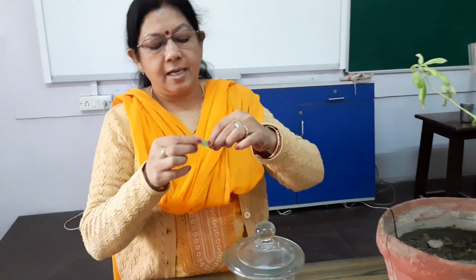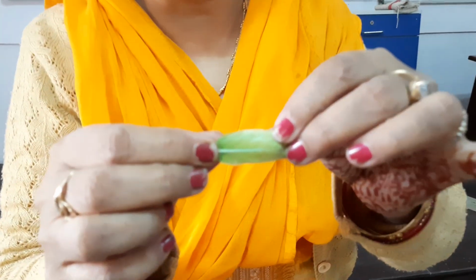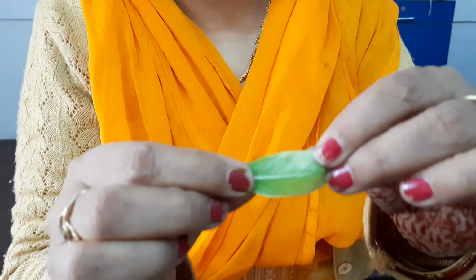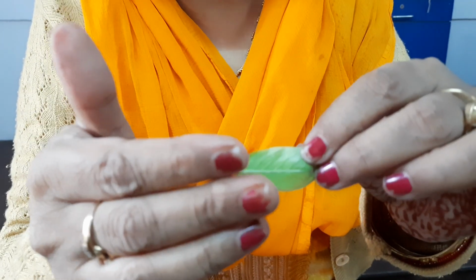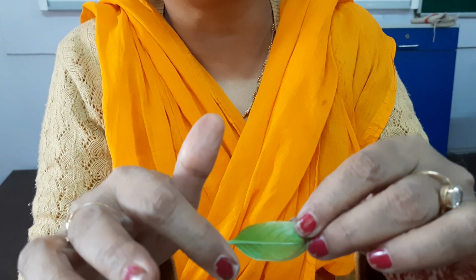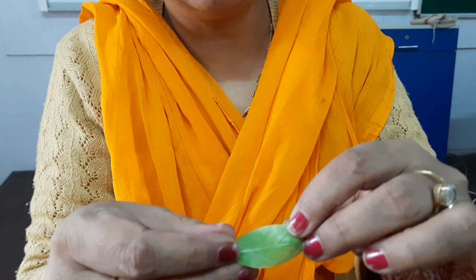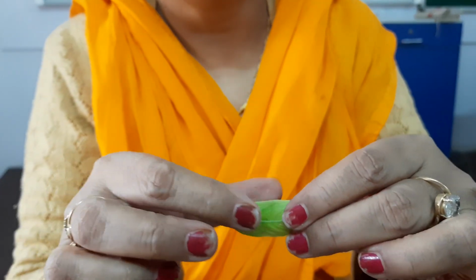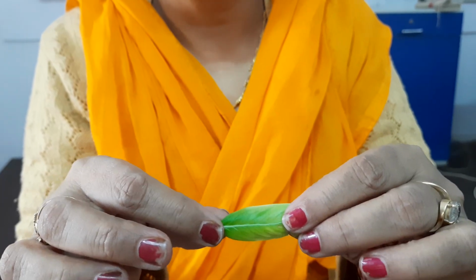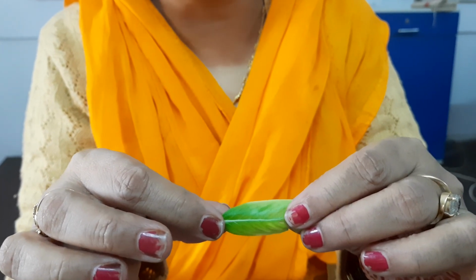What does it mean? It says that more water is lost from the lower surface, that is this surface. More water is lost, so therefore the paper on this surface has turned pink faster and completely. It means the structures from which the water is being lost are more in number on this surface, right? While on the upper surface, this one, that is the ventral surface, here the cobalt chloride paper is taking time and is slow in color change.